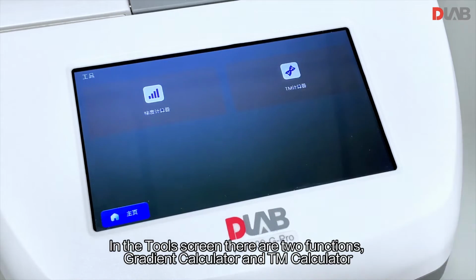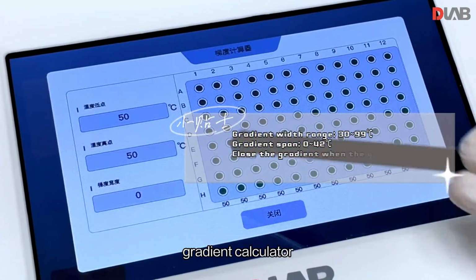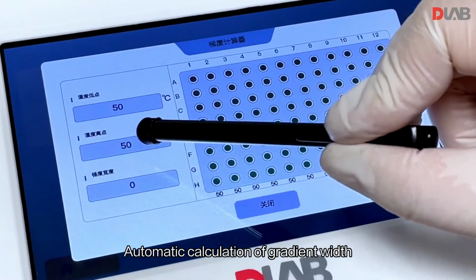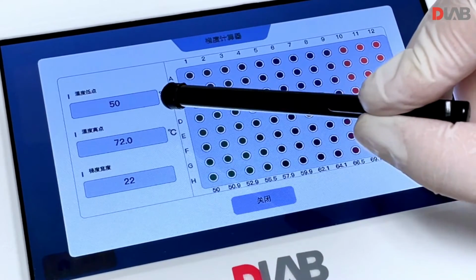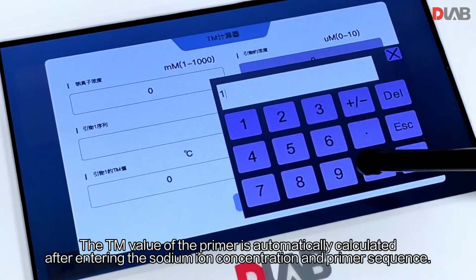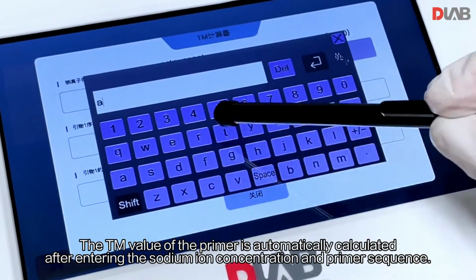In the Tools screen there are 2 functions, Gradient Calculator and TM Calculator. Gradient Calculator: after entering the temperature low point and temperature high point, the gradient width is automatically calculated. Whole temperatures for each column can be viewed on the right-hand side. TM Calculator: the TM value of the primer is automatically calculated after entering the sodium ion concentration and primer sequence.